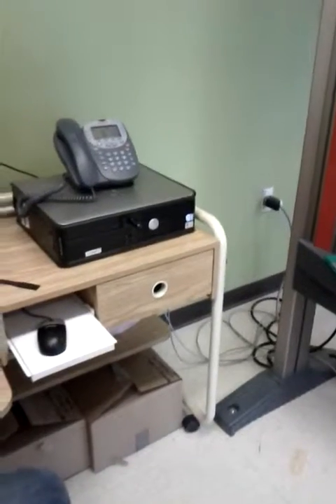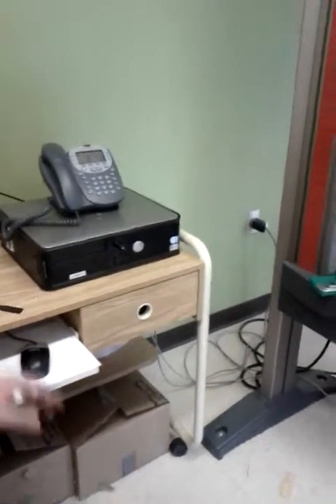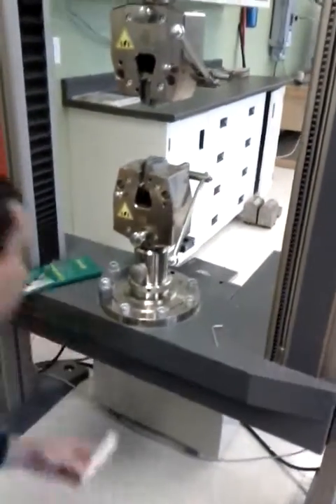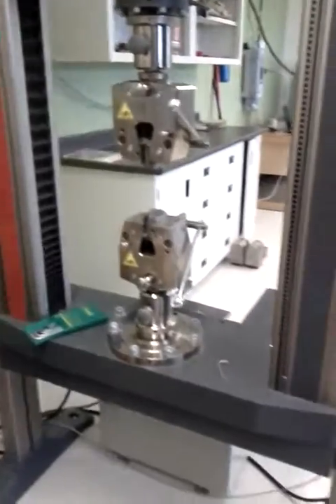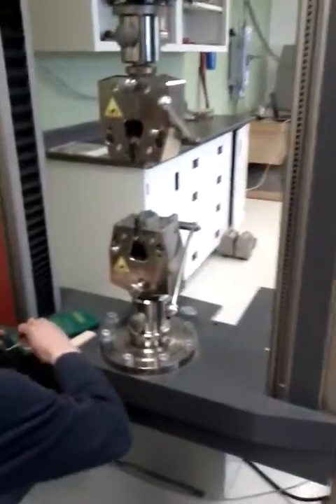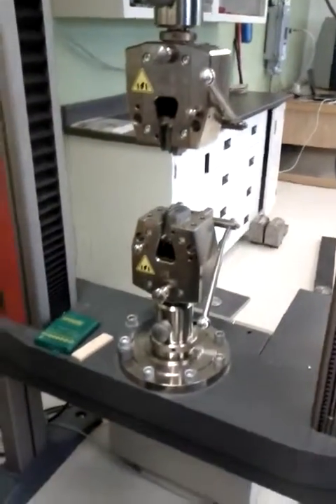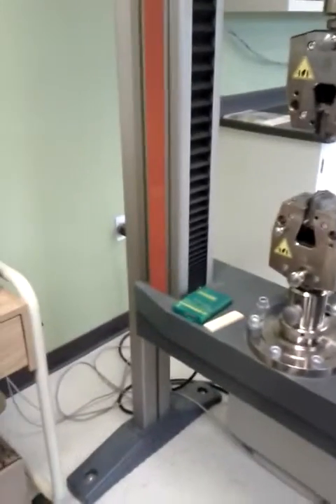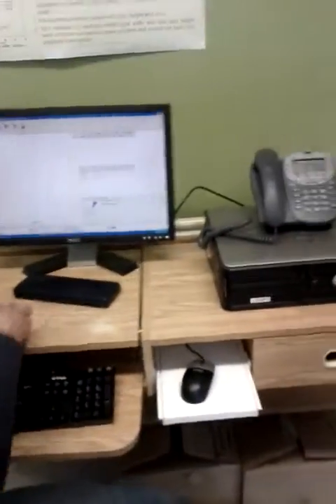Now everything is ready to begin. When I begin, I always do some kind of dummy test before I take any piece of wood, just to test if it works well, because in the beginning there's always something wrong, but now that I'm used to it, it's fine the first time. I put my sample inside, but before, I take its measurements.